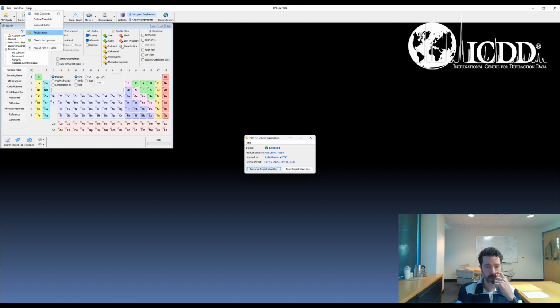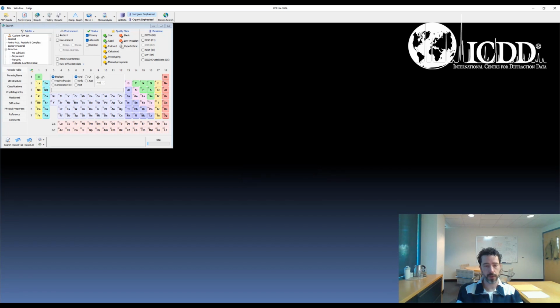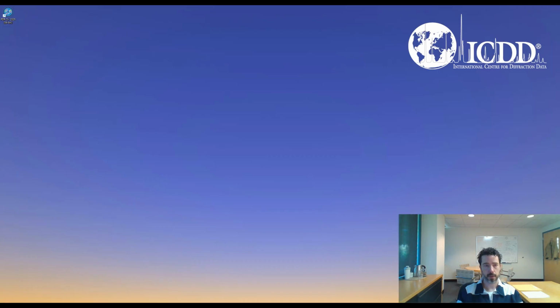All right, so you'll cut out from here. I'm going to close this. Okay, so let's go back. All right, now let's go back to the registration program.